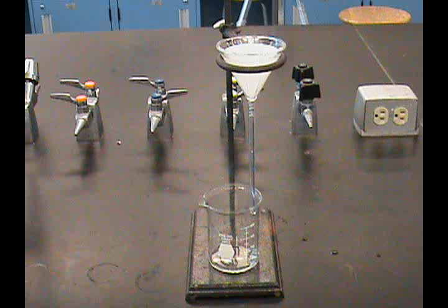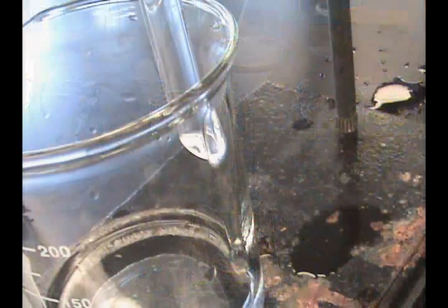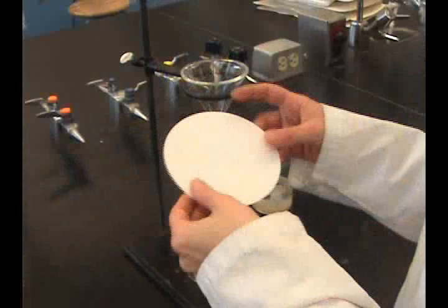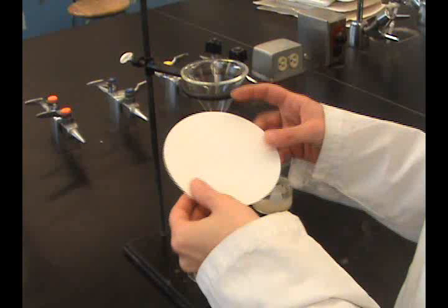Gravity filtrations use filter paper and a funnel supported by an iron ring. The funnel has a long stem with a slanted tip to help the flow of filtrate into the receiving vessel. The filter paper needs to be the correct size to fit into the funnel and the proper porosity is essential as well.